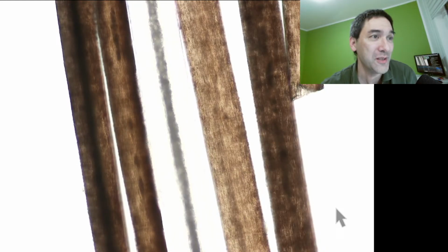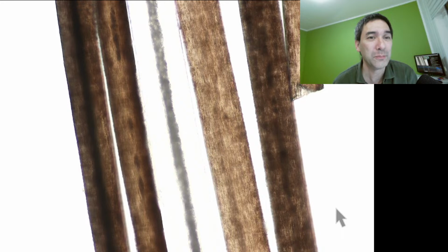So it's kind of the product of cells, and by definition, a hair is not alive. It's produced by the cells in the hair follicles. This is the reason why, when you look at hair like this, you're not able to find cells: it's just long protein fibers.